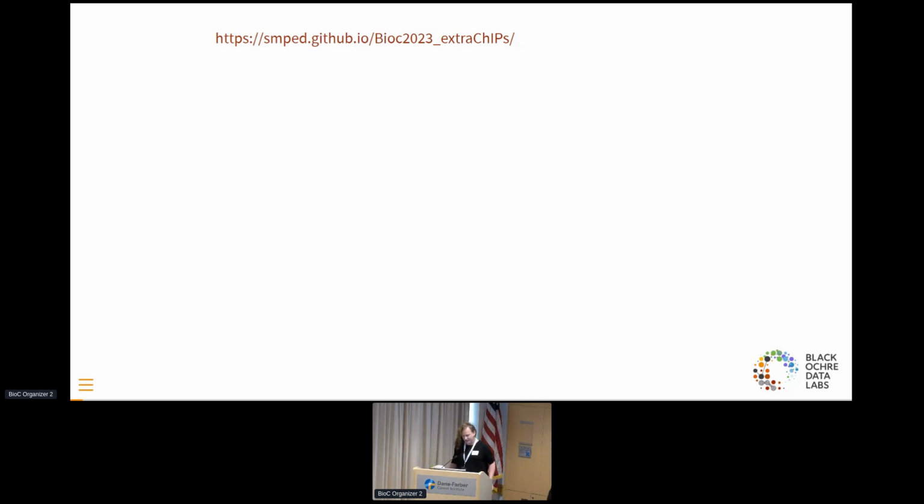Thanks, Tim. Appreciate that. So I started my preparation for this workshop by writing a big session, which is held at this address. And then I realized I'd done too much and there was no way we were going to get through it in three-quarters of an hour. So I then just prepared a little Quarto presentation. This address here has a workflow if you want to go away and have a play with the package in your own time. But as it is, I think I'll just talk people through what is essentially in the workflow. I hope that's okay.